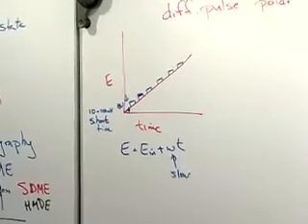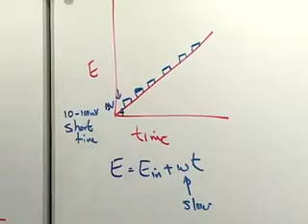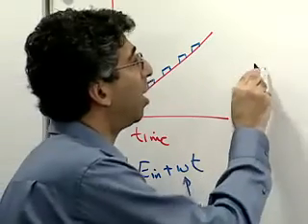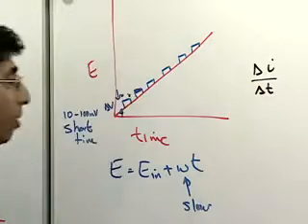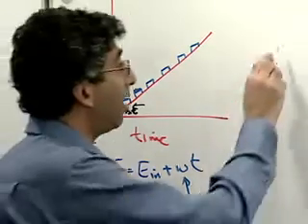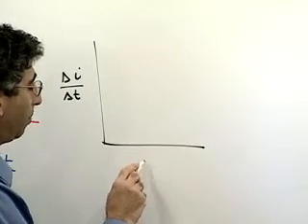So you could use a dropping mercury electrode for this, but you need not use it. And the idea is going to be, we'll measure the current at the beginning of this flat part and at the end of the flat part, and report then a delta I for each of these pulses, divided by the time length of the pulse. And so we have a pseudo-derivative here. And of course, the faster we pulse, the closer it is to a real derivative. And so we'll now make a plot of di/dt versus potential.